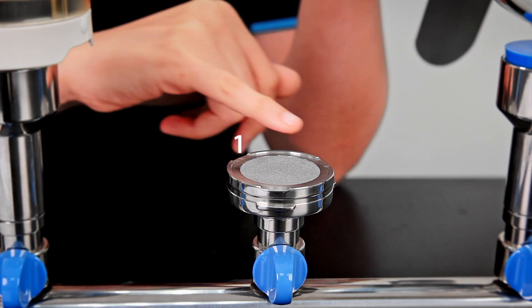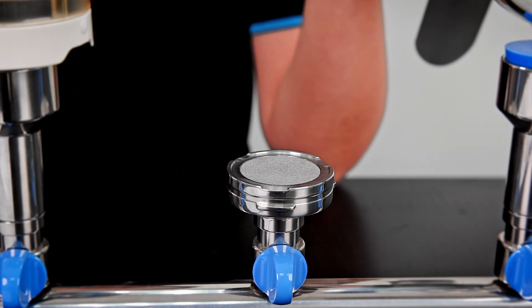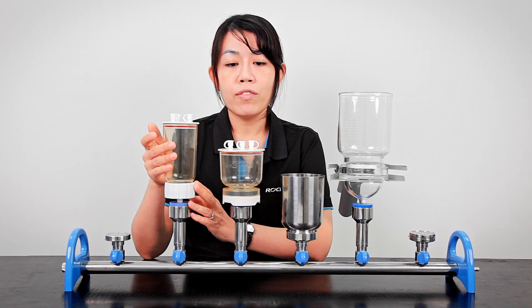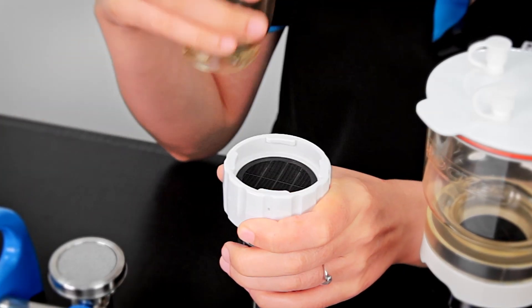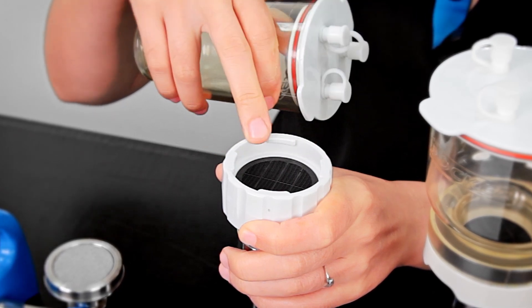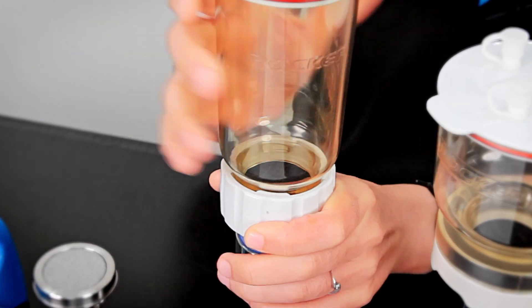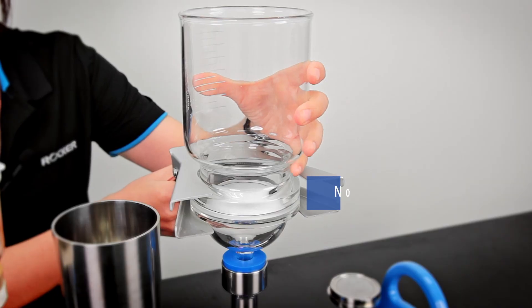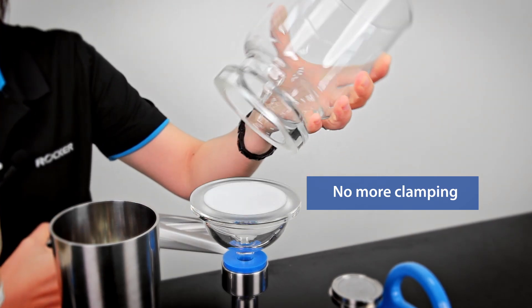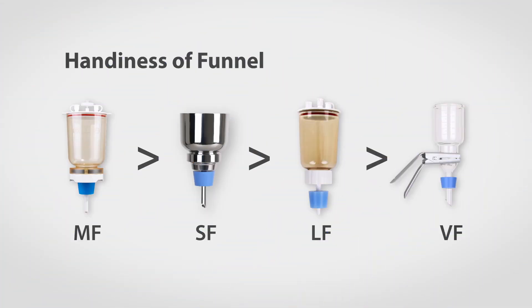There are three small cuts that allow you to use forceps to take the filter out without damaging its edges. As for the LF, it has our first spin lock design — it's also very easy to lock with no need for a clamp. However, it doesn't have the membrane guide design, and the filter membrane is placed inside the pot, so it takes a little more effort to take it out. That said, compared to traditional designs, it's still much more convenient and durable. Overall, all Rocker collections are easier than traditional clamps, especially the MF and SF, which are both very scientist-friendly.